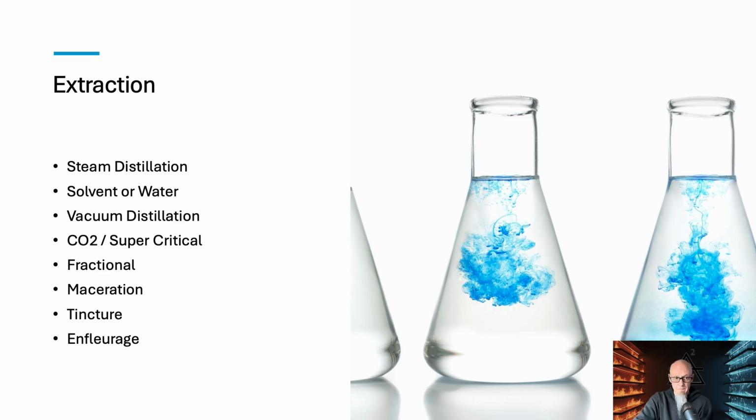Now it sounds great in theory. In practice, if you know what you're doing, it's also great. I do not recommend this for new folks who are just getting into any sort of chemistry, because there's a very high chance for breakage. The amount of pressure inside of that unit, if it's not controlled properly, can shatter the glass, and it'll just fold in on itself and explode. And so I don't recommend vacuum for new folks.